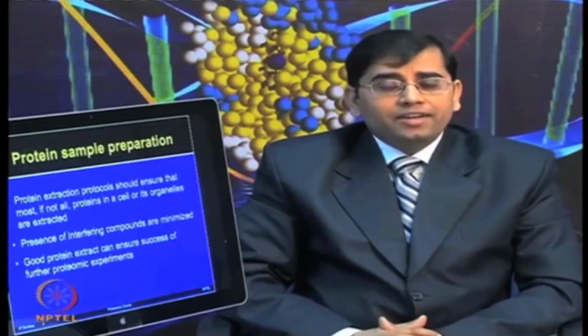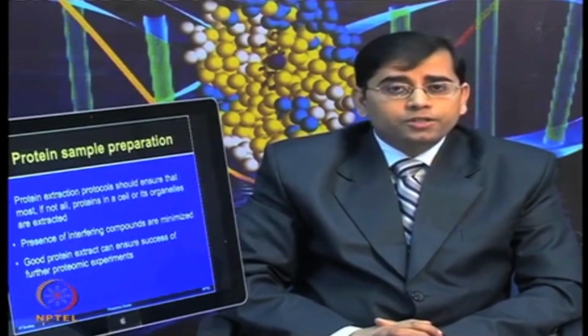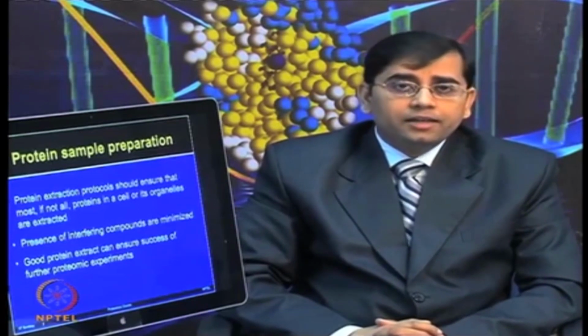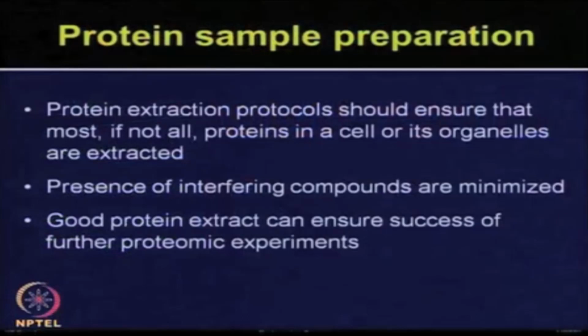Now, protein extraction protocols need to ensure that most if not all the proteins in a cell or its organelle are extracted. The presence of interfering compounds should be minimized. So, if you have optimized a very good protein extraction procedure, that should ensure that you have a very wide proteome coverage, and that is ultimately going to determine the success of your proteomic experiment.